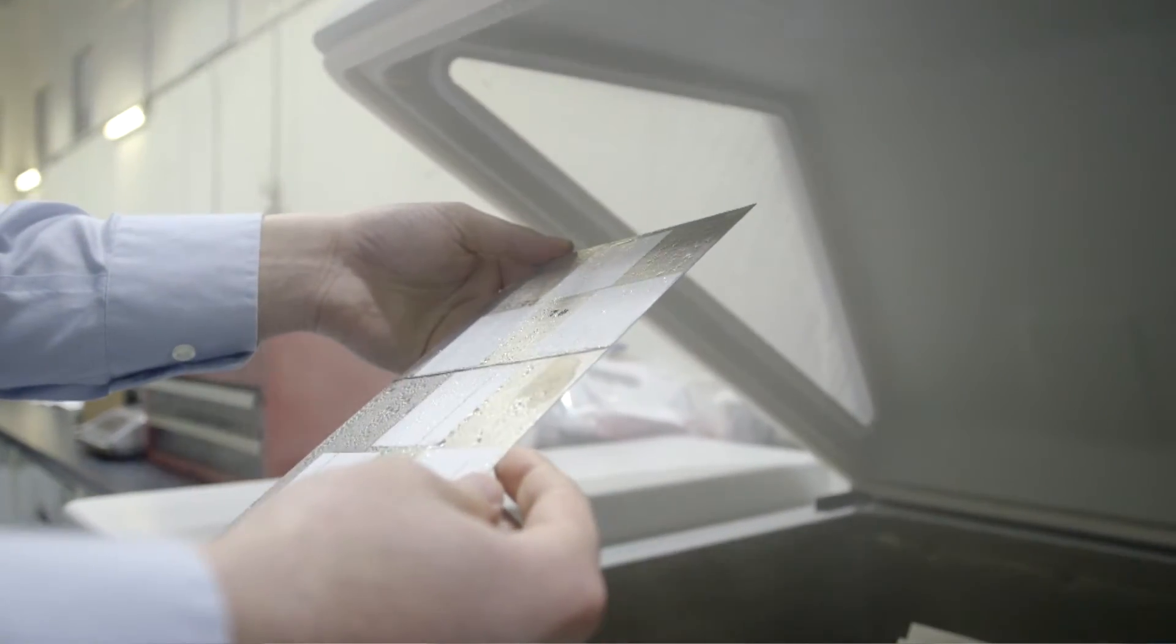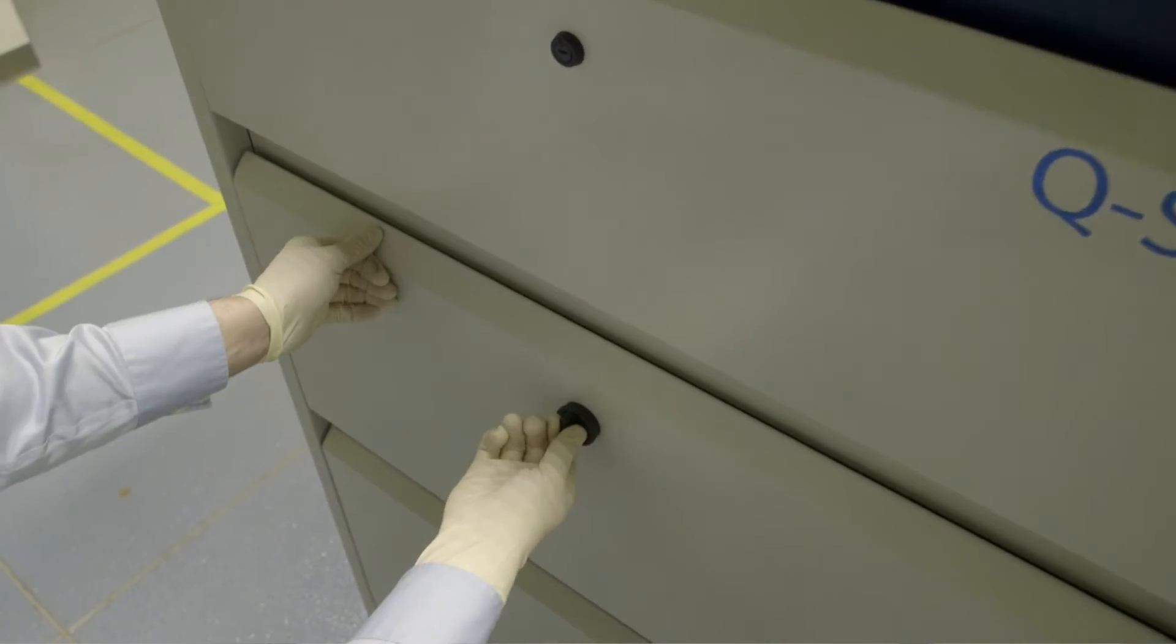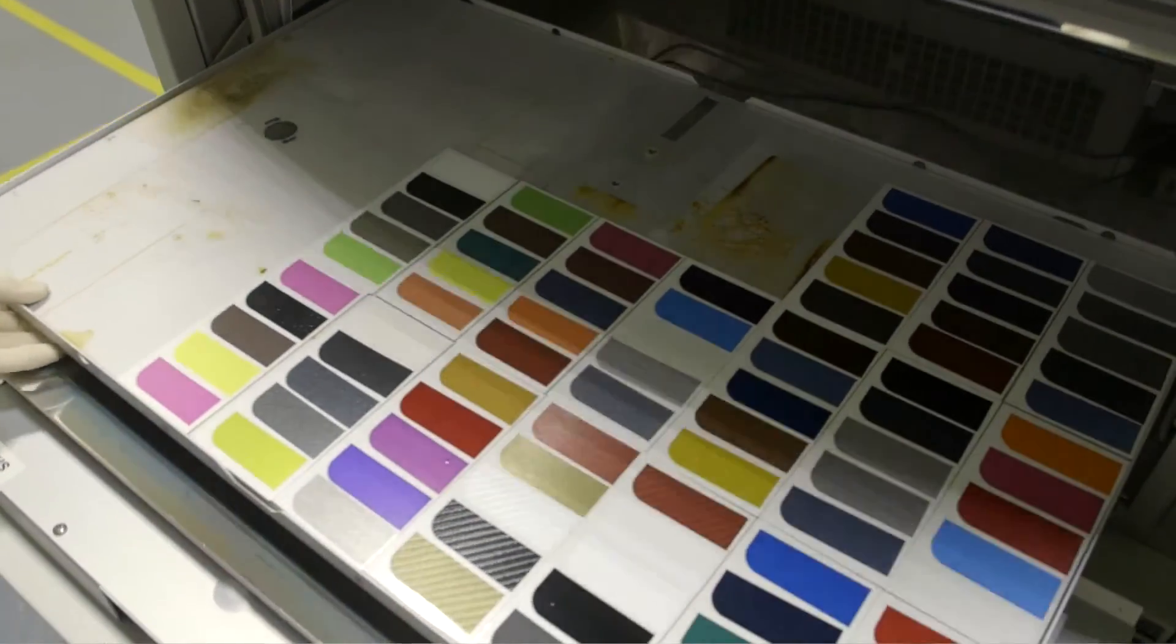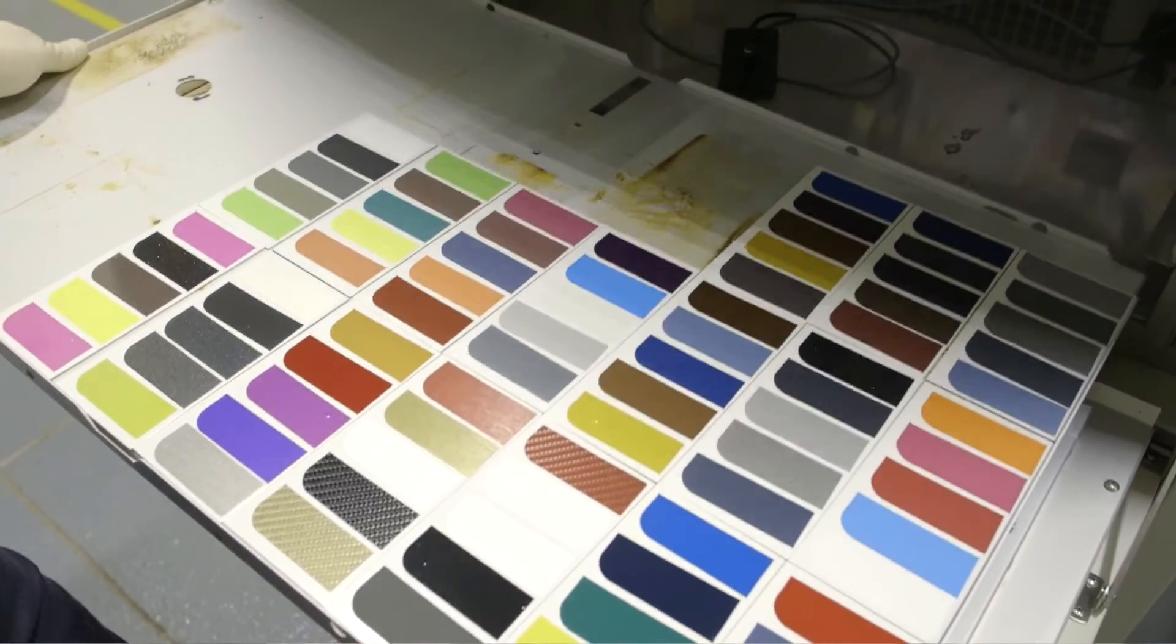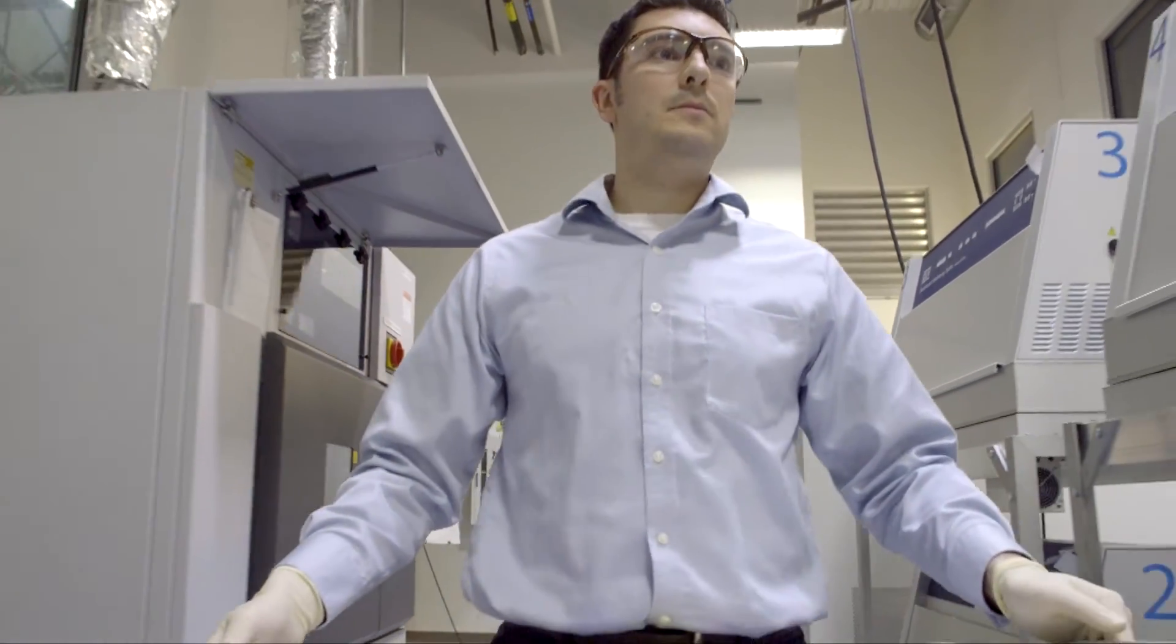The equipment in this lab is fully customizable. We can program in any temperature profile, light intensity, or moisture condition to simulate any customer application or specification to meet whatever the demand is.